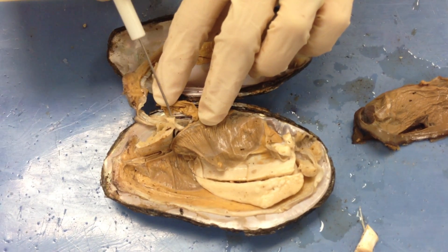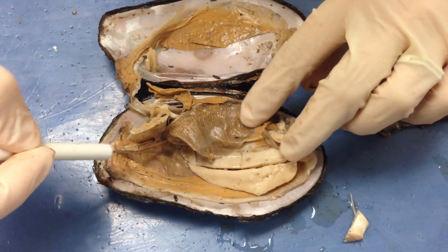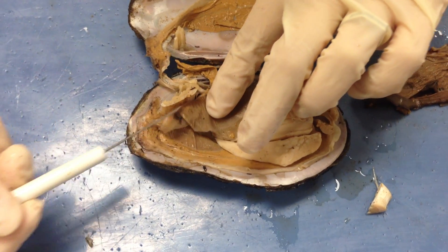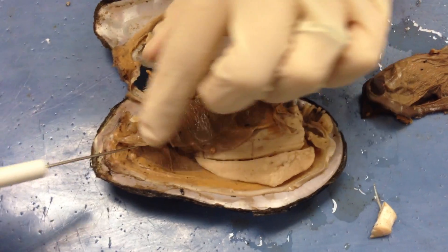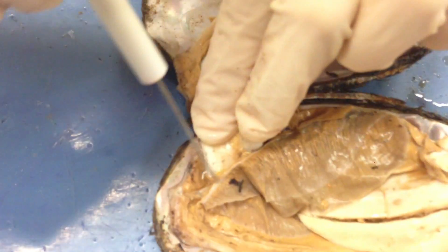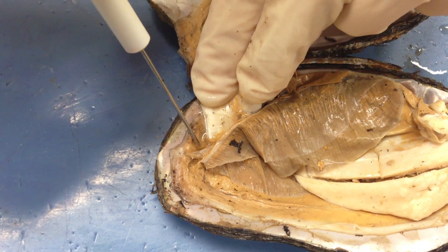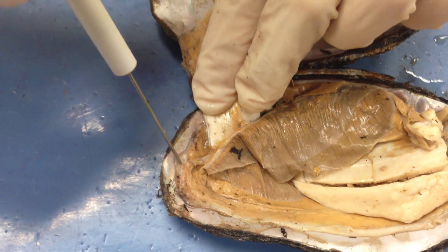We can also see part of the retractor muscle, which is right here. If we look at this structure right here, the clam has these two structures. Remember, they're bilaterally symmetrical, so these are the gills. At the top of the gill, you can see these are going to be your siphons. You have an incurrent and an excurrent siphon — an incurrent where water and food comes in, an excurrent where everything else comes out.